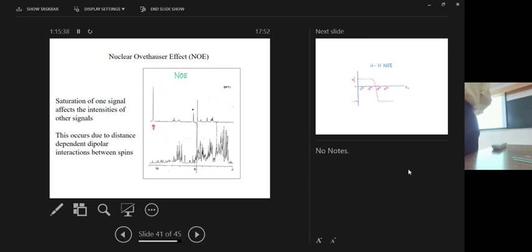Of course, where there is a perturbation versus no perturbation, this will have the maximum intensity. And you see intensity is at other places also. Why? Otherwise, if it were all the same, it should be zero. But there are intensities here as well. That means this spin is interacting with these protons. This is the NOE. This is called the nuclear Overhauser effect.